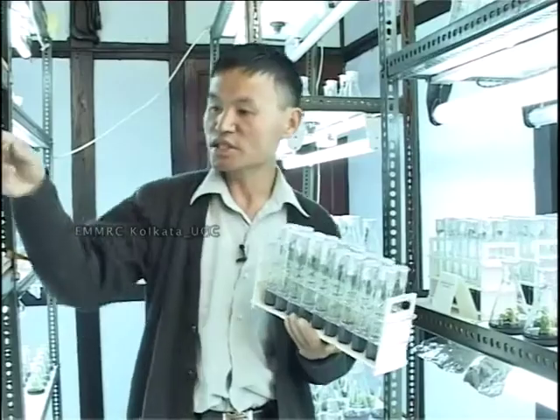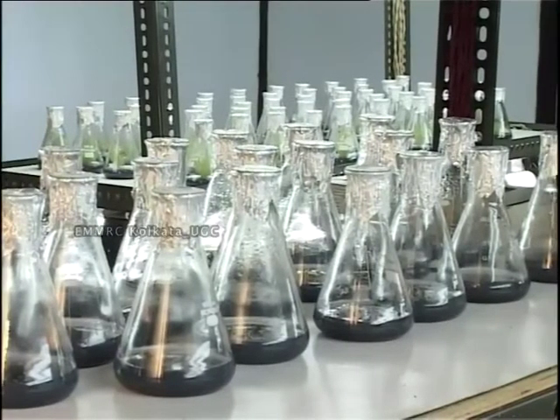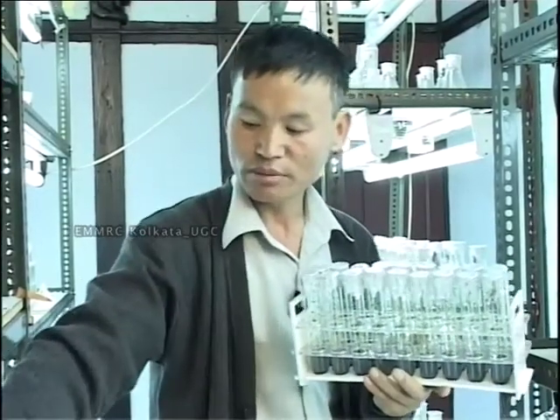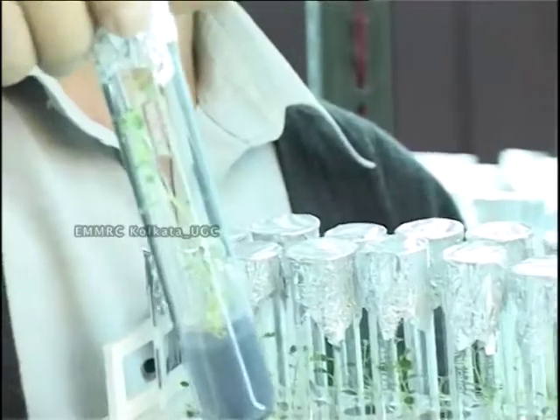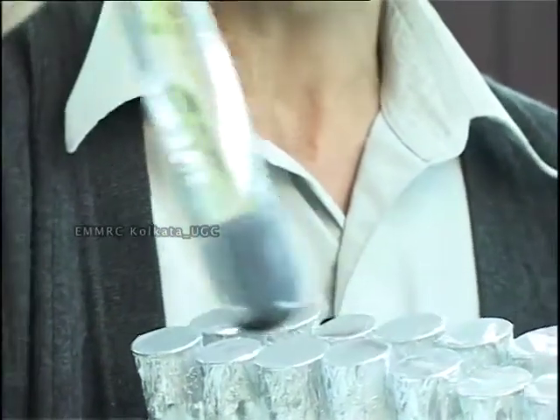We germinate the seeds like this in this flask. When they start germinating, it comes like this. The next stage is like this. Here we thin it out. We take it out and put it into test tubes like this to let it grow faster. Once this stage is reached, multiplication starts again by nodal culture. We cut into pieces and it is done like that.